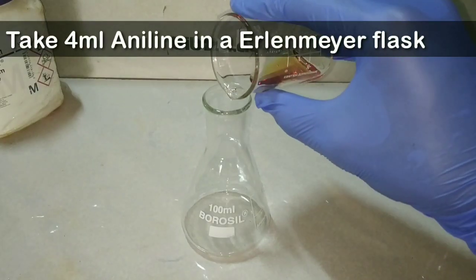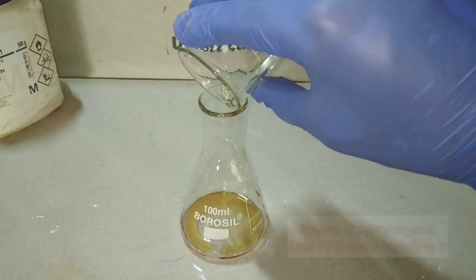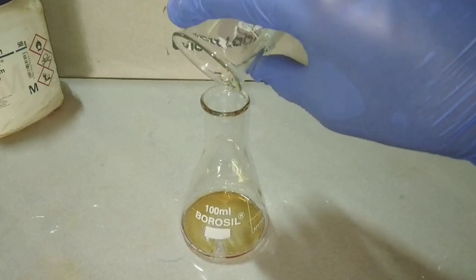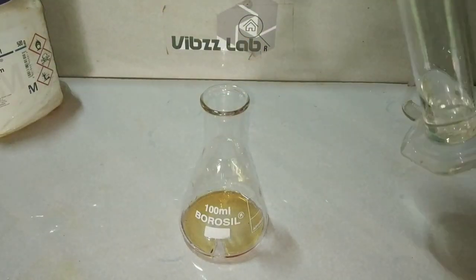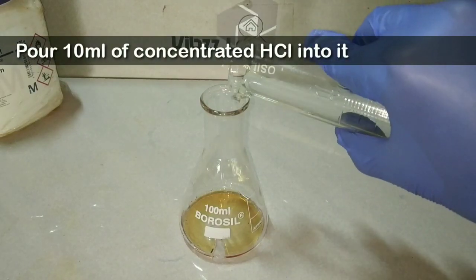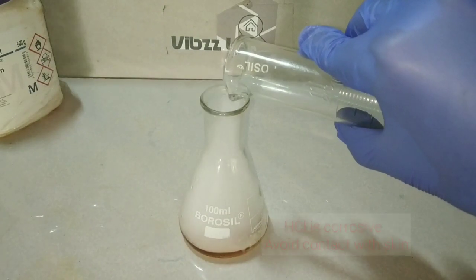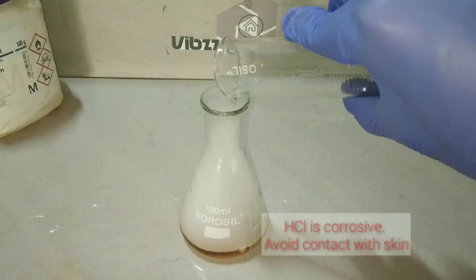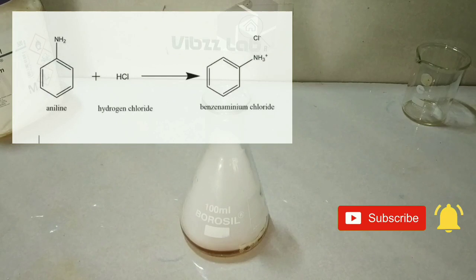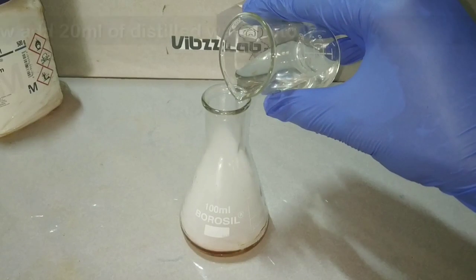The first step is to take approximately four milliliters of aniline in an Erlenmeyer flask. As you know, aniline is carcinogenic, so we have to use personal protective equipment like gloves, goggles, and a respiratory mask while handling it. We then pour 10 ml of concentrated hydrochloric acid into the aniline. You can immediately see the formation of white fumes — this is normal. Here aniline reacted with HCl to form benzene aminium chloride ion.